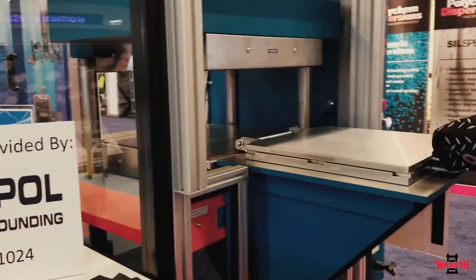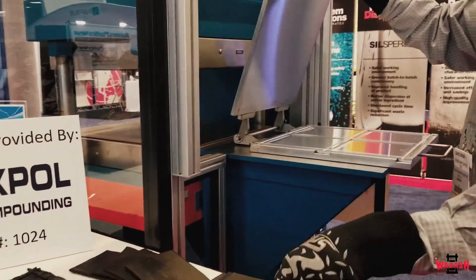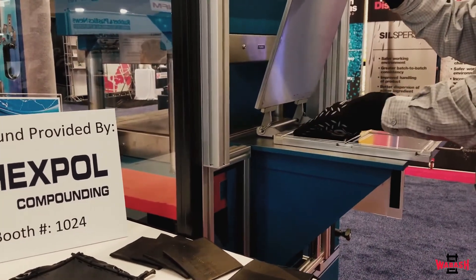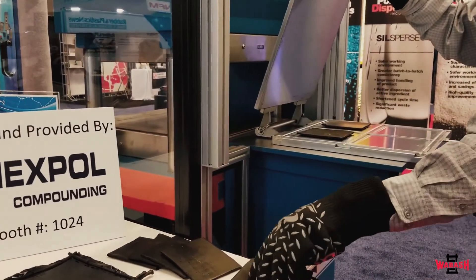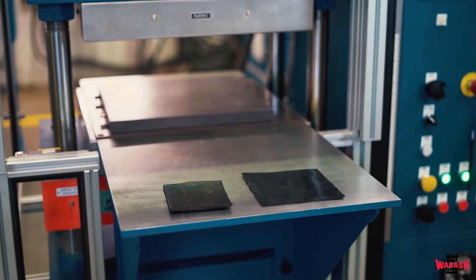This press is used for preparing rubber test slabs per the ASTM D3182 procedure for quality control of production, research and development, and for comparison of different materials. Here are samples of the uncured as well as the cured rubber test slabs that are typically used with this press.